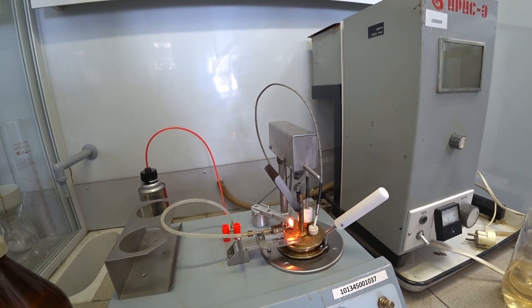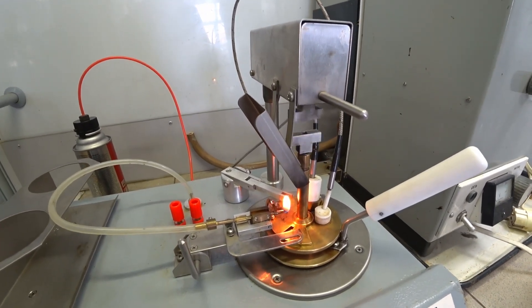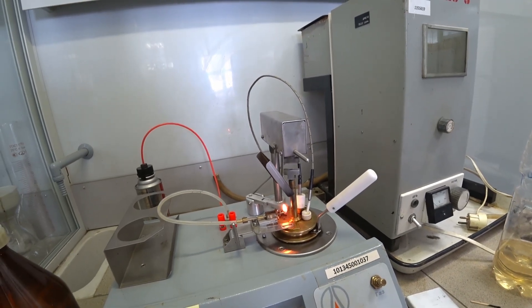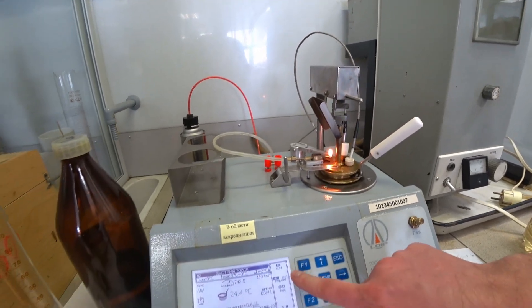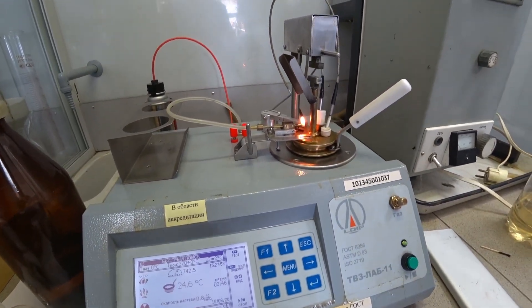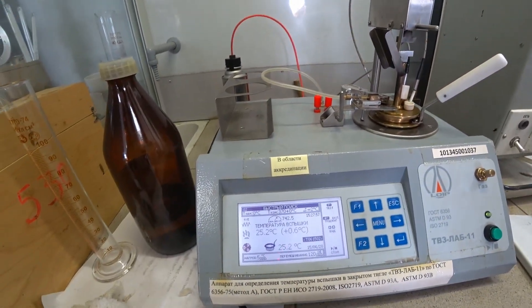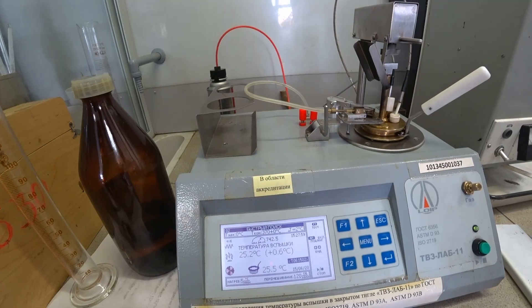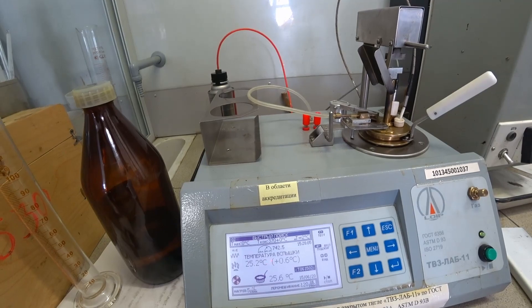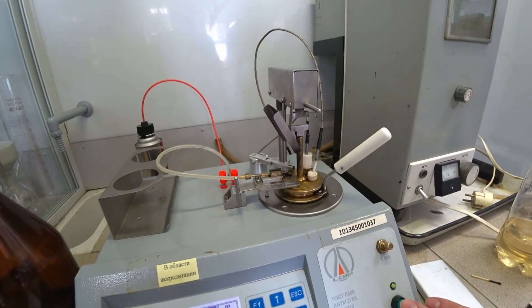So we are just waiting for the flash opening. You have to press on this button — test one. And now we press this button, and we have the result: the flash point is 25.2 degrees. And that's all.